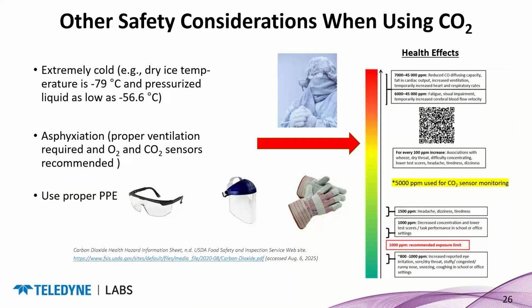As we've touched on a little bit, CO2 is very cold under pressure. Of course, dry ice you would have to handle with gloves, and even as a liquid, it's very cold. So gloves are recommended when you're working with the dewars or cylinders. You obviously need to be somewhere where you have high air turnover. So you want to make sure you have good ventilation.